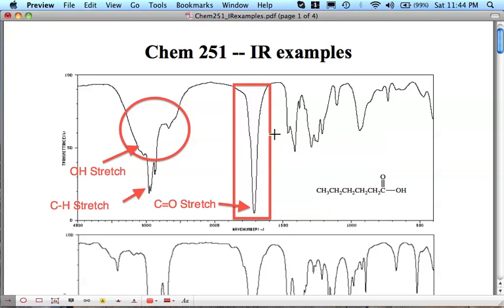We're not going to normally be annotating the peaks down in the fingerprint region. We won't always know. You'll always see some right around the 1400 up to maybe almost 1500 range. Those are some CH bending that you often see. Now, when I point out the CH stretch, I'm going to be a little more careful about it. Notice that these are coming just slightly below 3000.